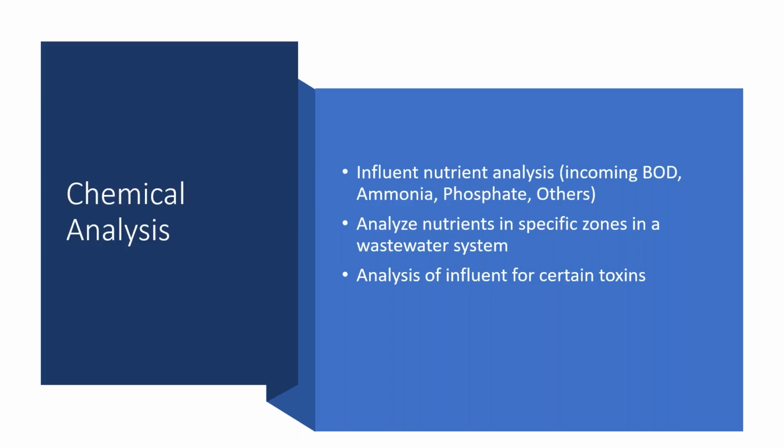There might not have been any environmental changes occurring that have been substantial enough to do what you would expect, which is to impact the nitrifiers. So what you're seeing is decaying bacteria, and you won't know where it is, or if that's the case, unless you're analyzing the nutrients in different regions of the plant. So you test one of your aeration basins, you notice that one has elevated ammonia. There's a good chance that one would have sludge accumulation in it.